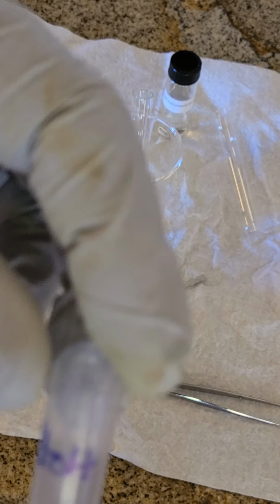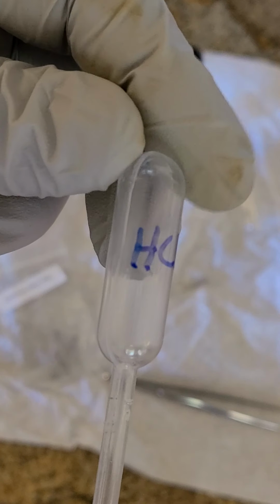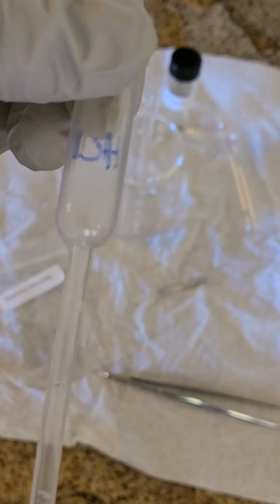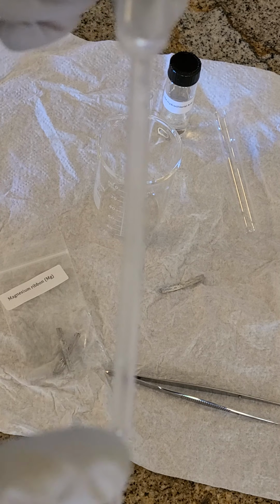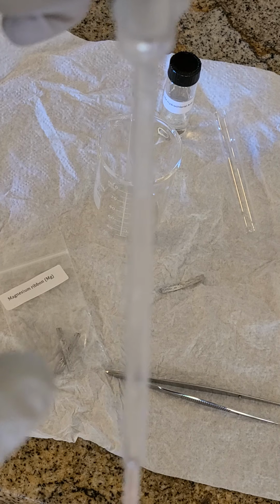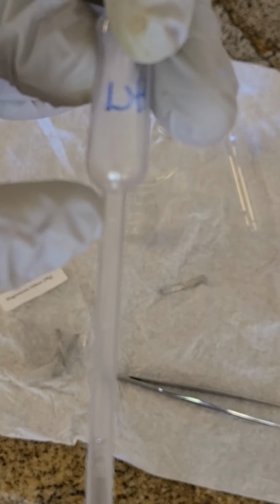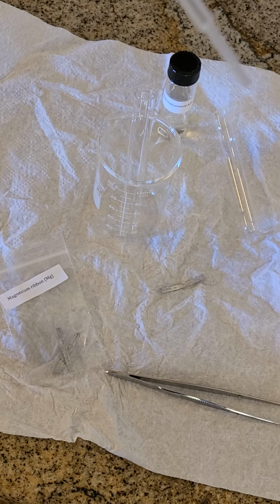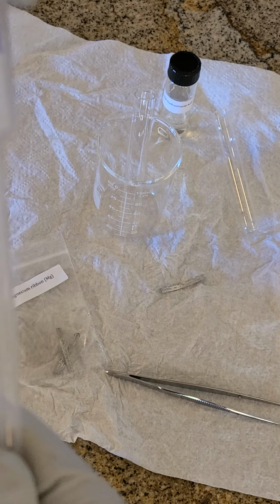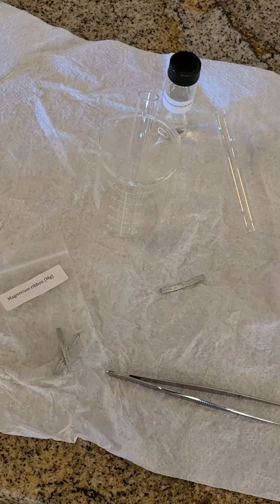Here's my ethanol pipette. I've got a water pipette. I just keep reusing them because I'm using the same material. But here's my HCl pipette, my hydrochloric acid. When you look at your pipettes, there's a couple of graduations. My video doesn't do a great job of refocusing, but there's a graduation halfway that's 0.5 mls, and towards the bottom of the bulb, there is a 1 ml graduation. You're supposed to add 2 milliliters here. So instead of using a graduated cylinder and having to clean it out, just get one of your disposable pipettes labeled as HCl, fill it to that mark twice, and drop it into the test tube. It doesn't have to be exactly 2 mls. So I'm going to go ahead and do that.